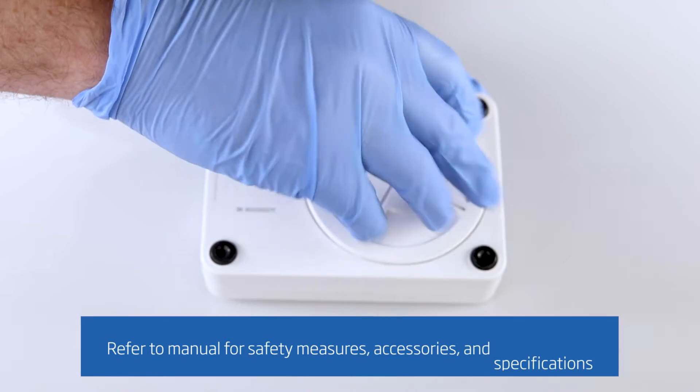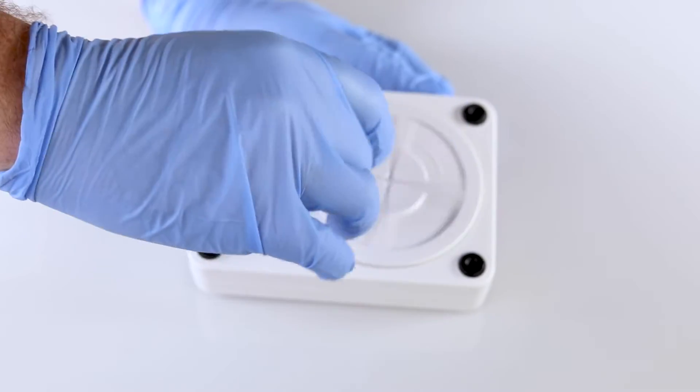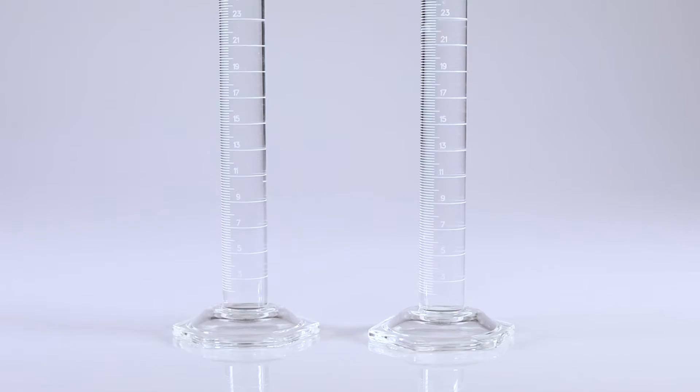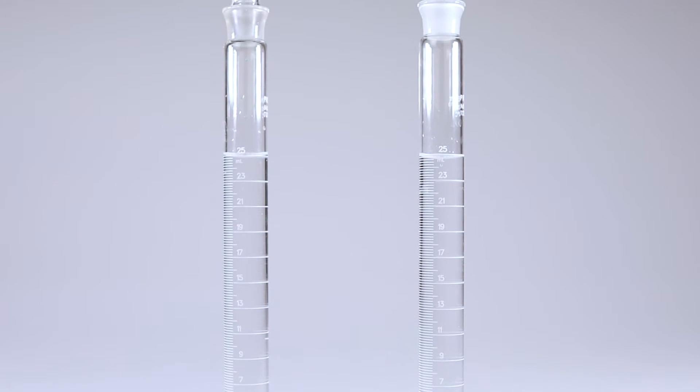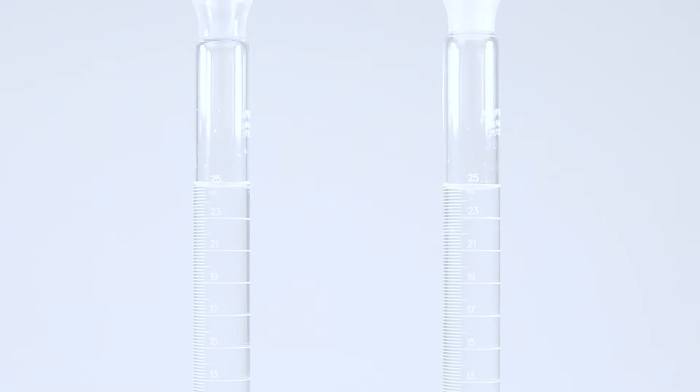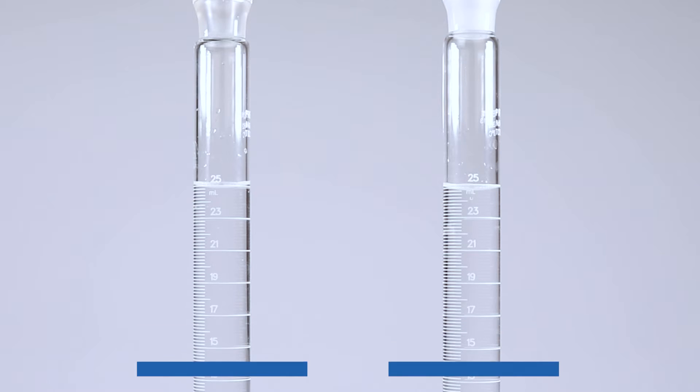When you first receive your photometer, install the batteries on the underside of your meter. Now you're ready to begin. Start by filling each of your graduated mixing cylinders to the 25 milliliter mark with the sample. It is good lab practice to label your cylinders number one and number two, or blank and sample, to ensure you are following the testing procedure correctly.